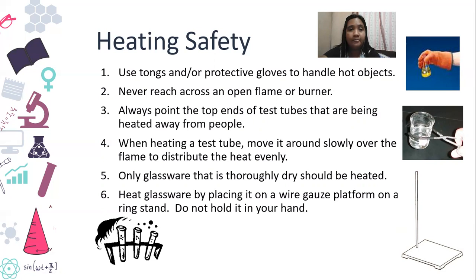Only glassware that is thoroughly dry should be heated. Make sure that, for example, if you will be using a set of test tubes and you wash them and then use them for the next step in the experiment, you need to make sure that they are thoroughly dry. We have rags to dry them up, so please dry them up first.